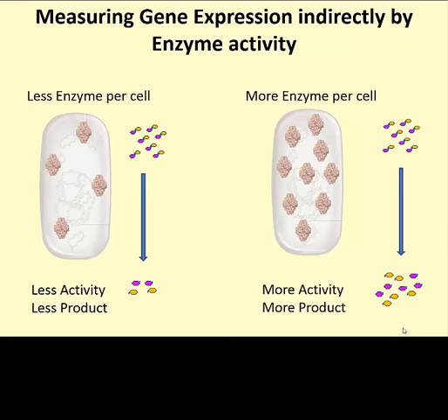The enzyme activity assay itself is actually done outside the cell in vitro. In order to take exact time points, we have to break open the cells to get to the enzymes. Now, to obtain active enzyme, we want to stimulate the production of lactase, and one way to increase the expression of the lac genes is to add lactose to the bacteria in the absence of glucose.